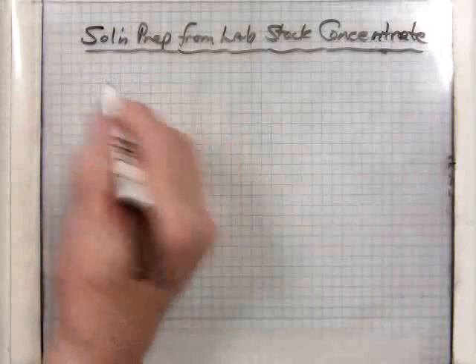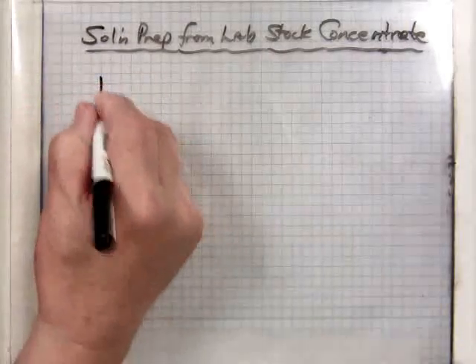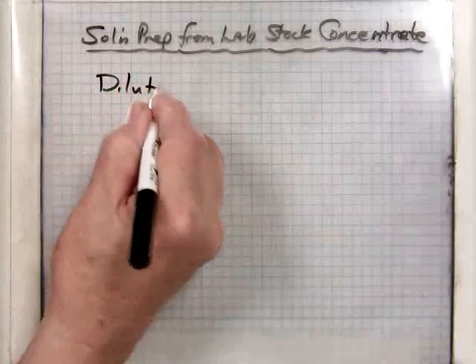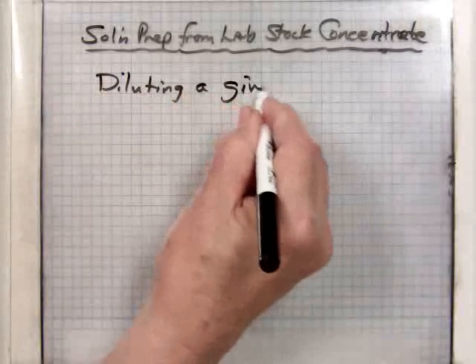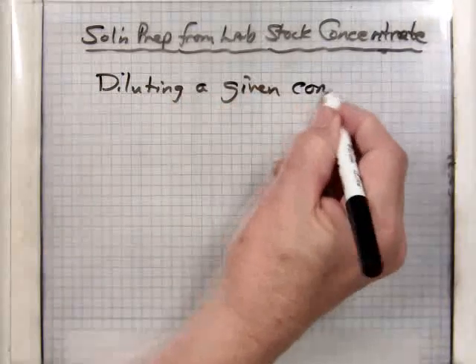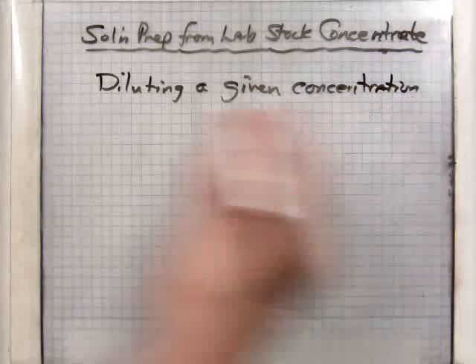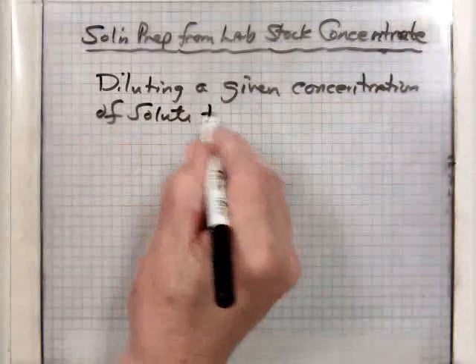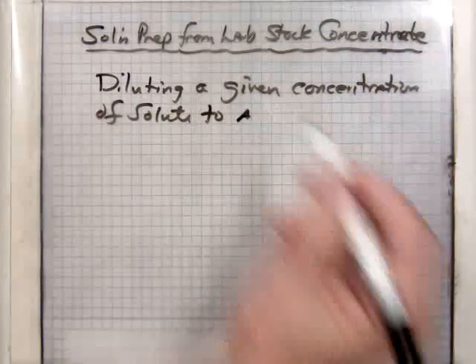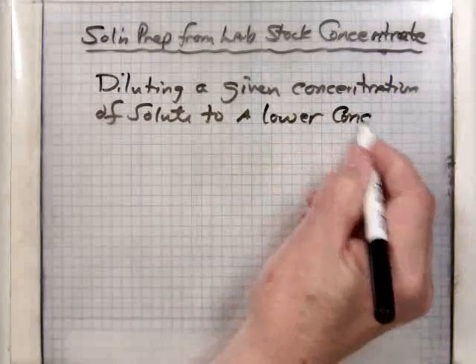So, when we do that, you are diluting a given concentration of solute to a lower concentration value.